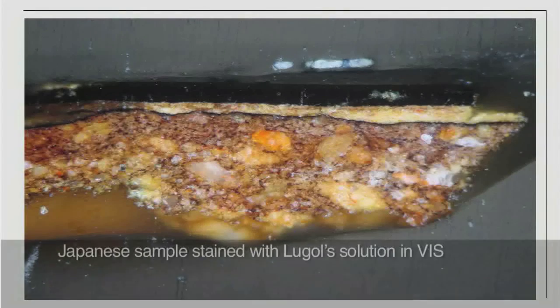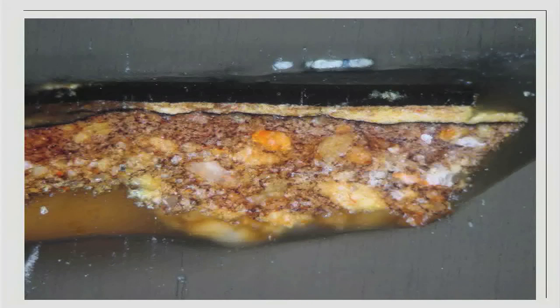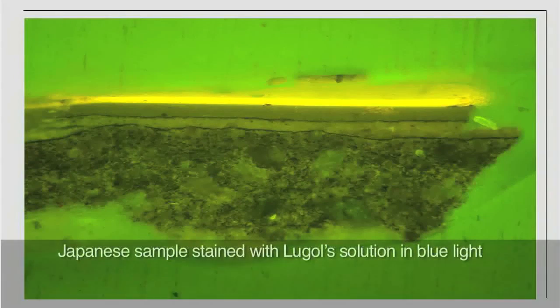The cross-section of the Japanese lacquer sample shown earlier now displays a lower foundation layer that contains a small amount of starch. The positive staining result can be clearly seen in visible but also in blue light under the microscope.